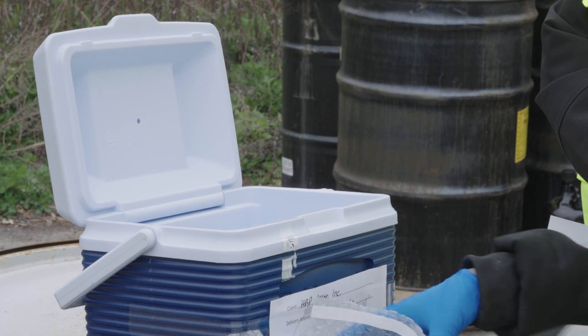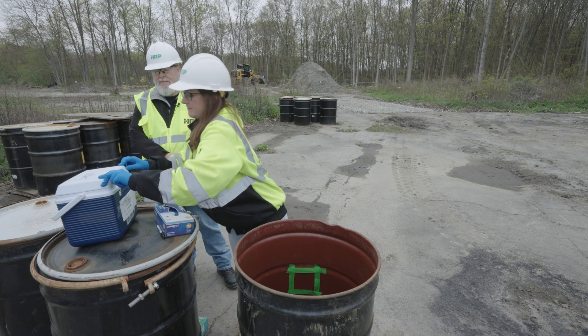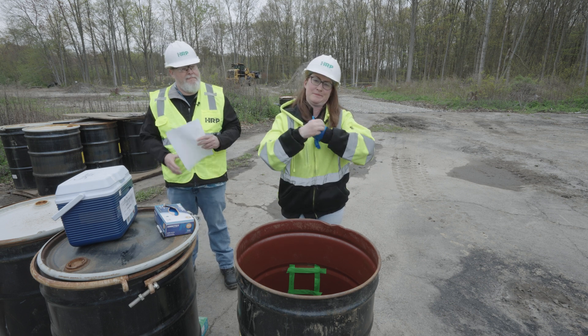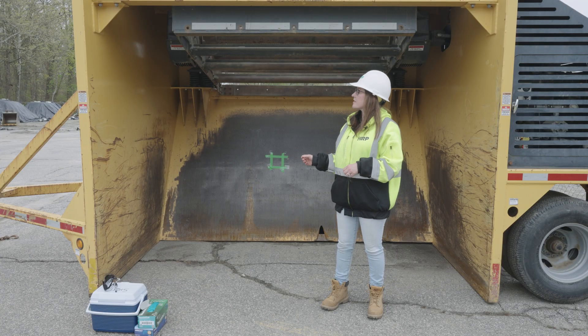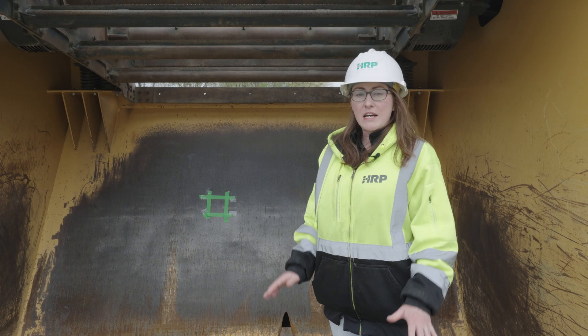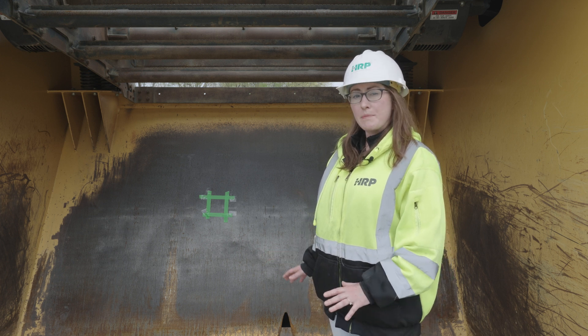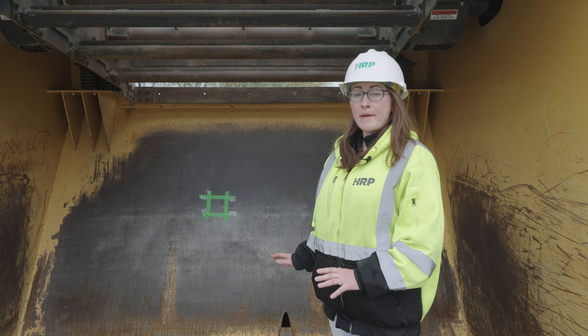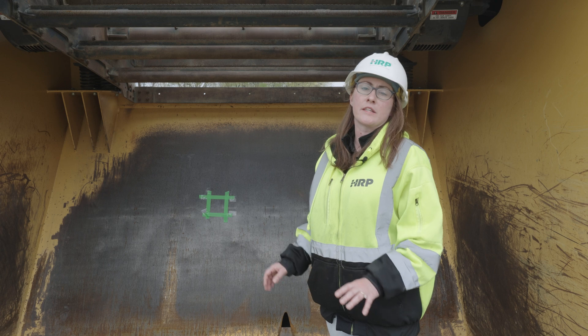We have a cooler full of ice that we will place these samples in. This is the screener that we used for this project — what it does is it separates the soils from other debris that we were trying to remove. Because this job site contained PCB-contaminated soil, we should be collecting a wipe sample to confirm that this equipment was properly decontaminated before it leaves the job site.